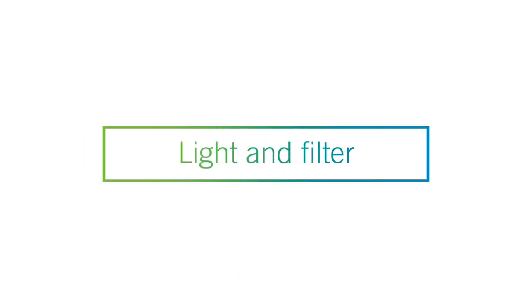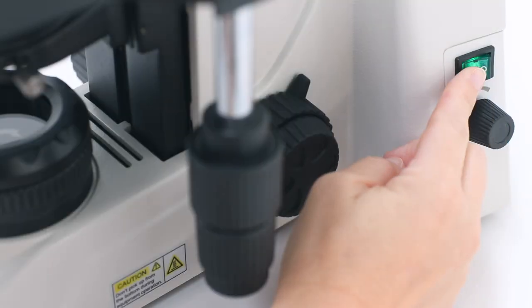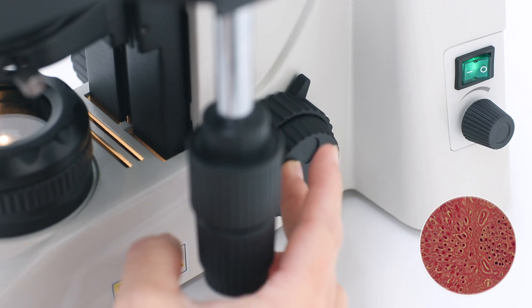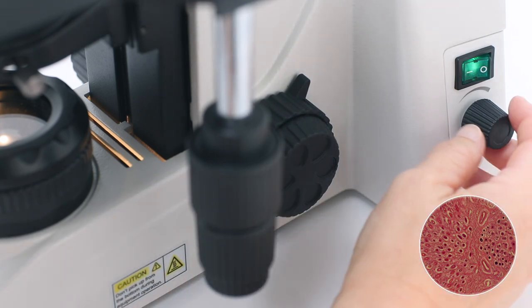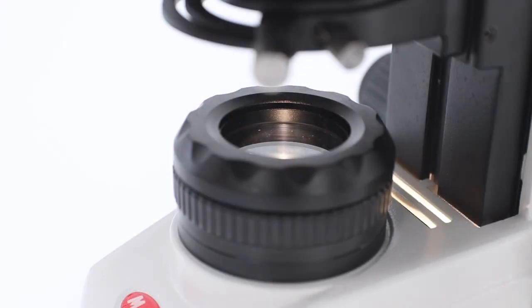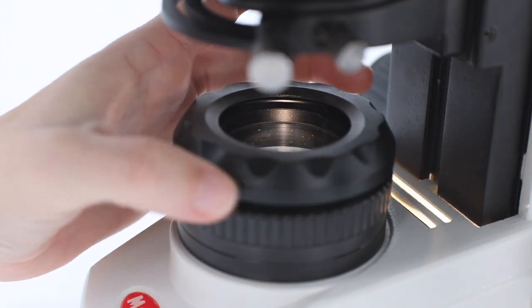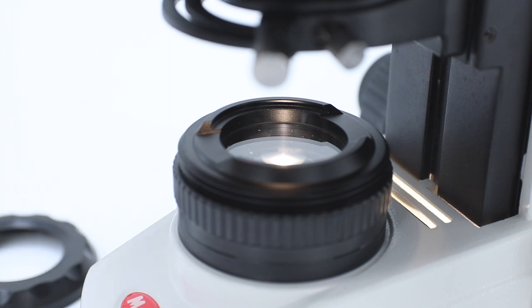Switch on your microscope and adjust both the focus and light intensity of your sample to an optimal level. Then, on the filter holder, place the blue daylight filter, which is usually included in a tungsten or halogen light microscope's standard packaging.